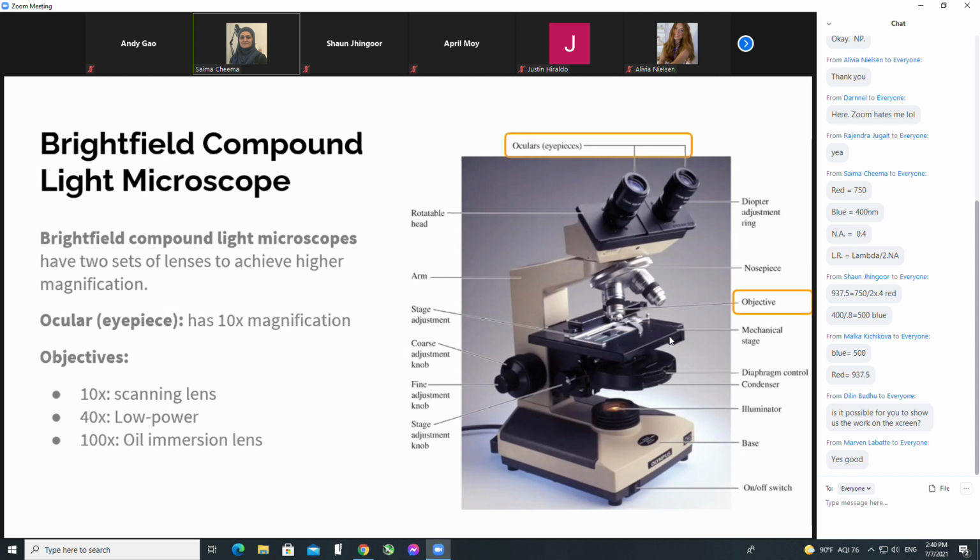All right, so who can tell me the proper sequence of events of using this bright field light microscope? What do you do first, and then how do you go about it? Let's start with, it's plugged in already and the light's been switched on, and you want to go in with the slide now. What do you do?